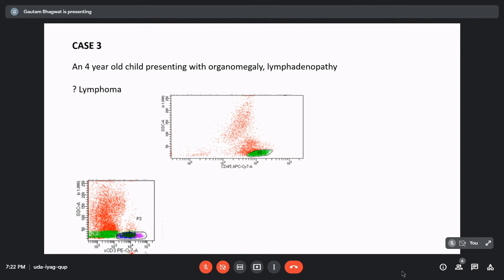When we see a CD3 component, we see there are lots of cells in this CD3 component. So most of these lymphocytes were T lymphocytes. Usually what we do is look at the CD4/CD8 expression, and as I told you, there is a beautiful pattern to CD4 and CD8, with a 4:8 ratio of almost 2:1.